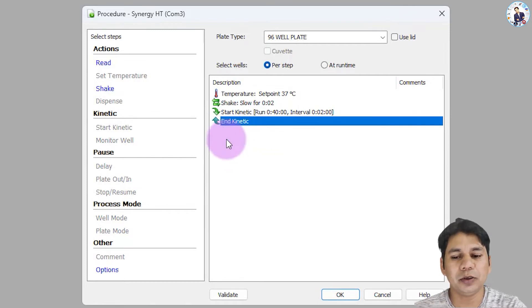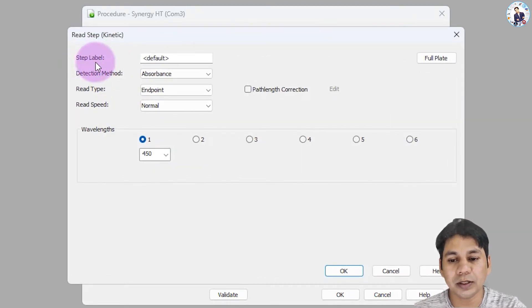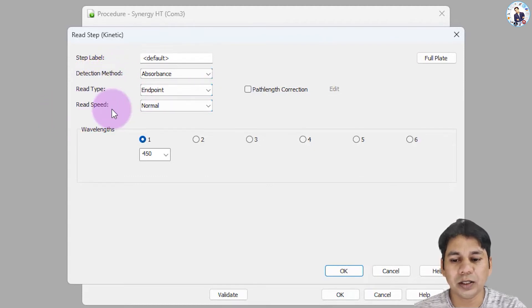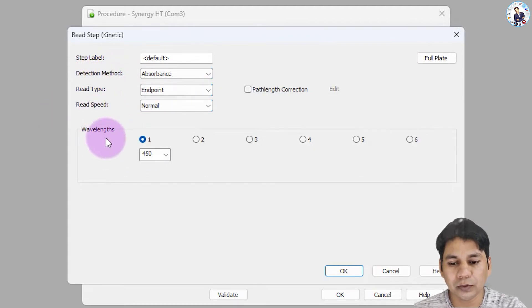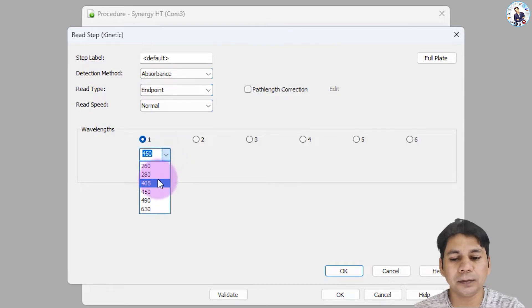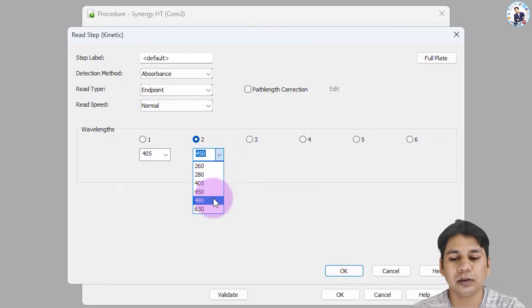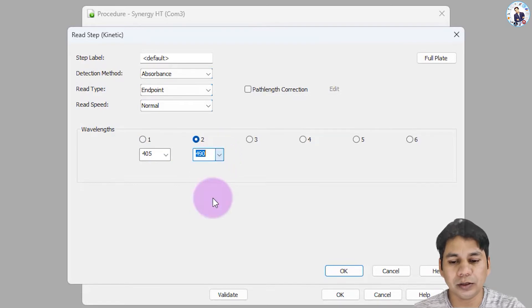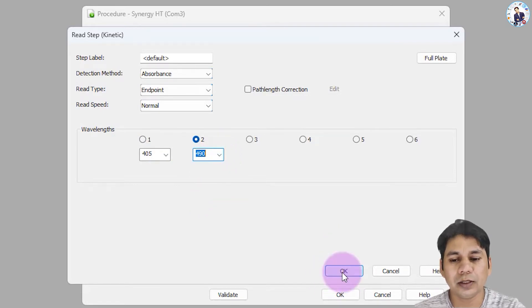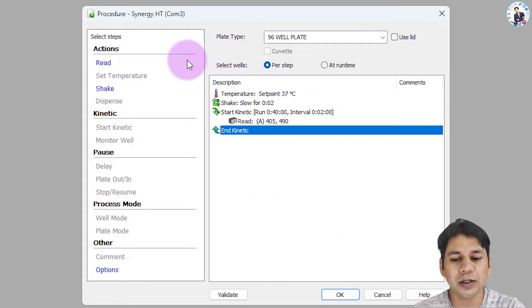Now you have to define the absorbance value. Click on 'Read.' The detection method is absorbance, read type is endpoint read, speed normal. The first wavelength is 405 nanometers for this clinical assay, and the reference wavelength is 490 nanometers. Click OK. You can see all the steps required for the procedure are now completed for this assay.